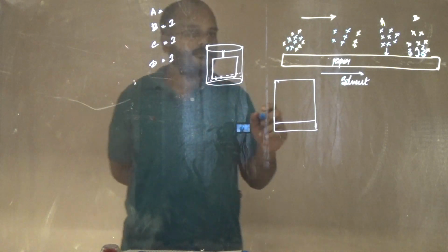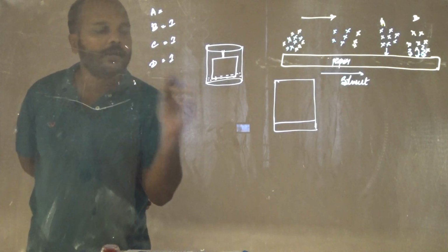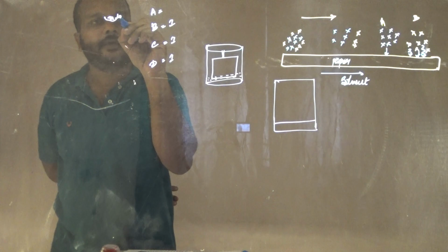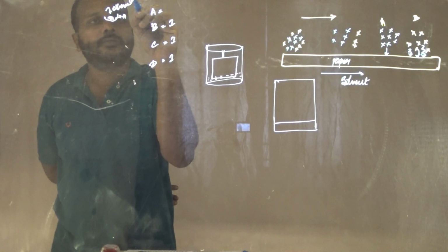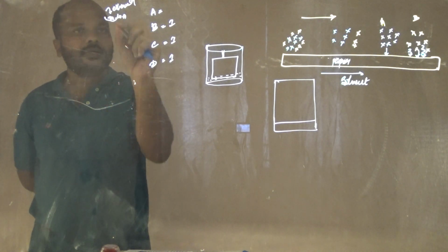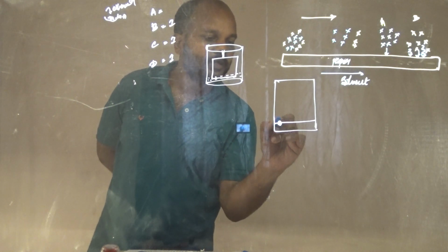Now, using a small micro needle, just prick. Consider this containing component A. You mix component A with the ethanol. Using the needle, you apply a spot of component A here.